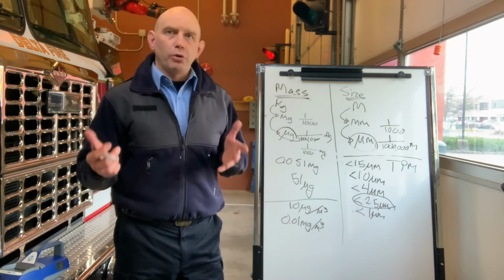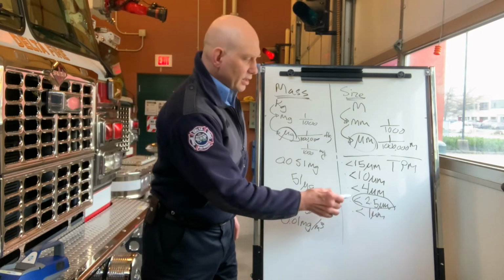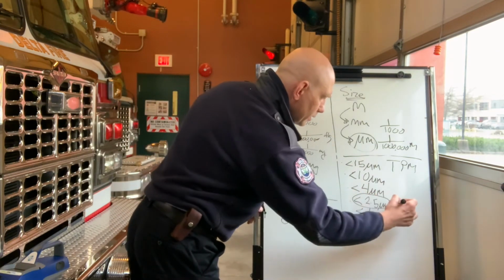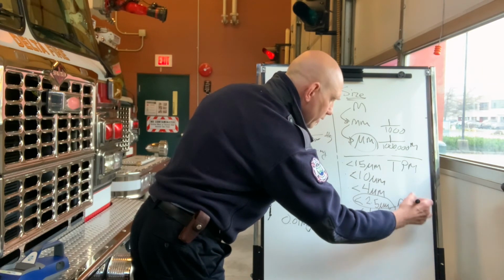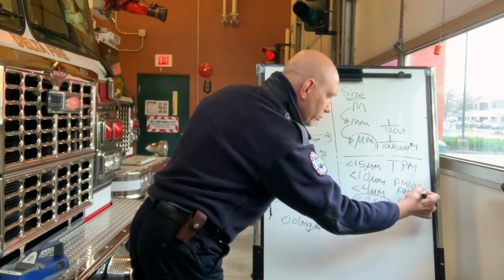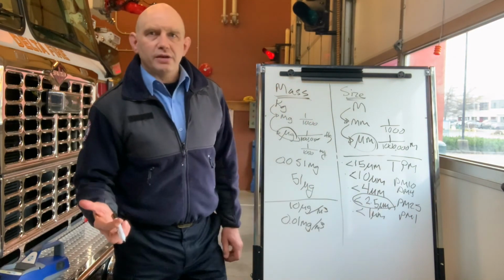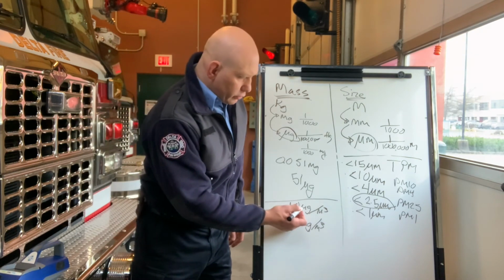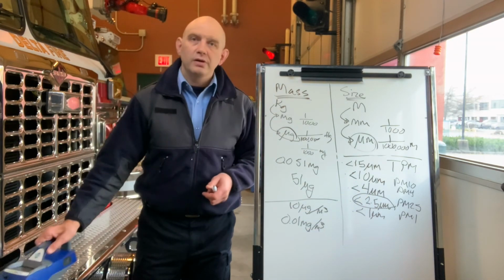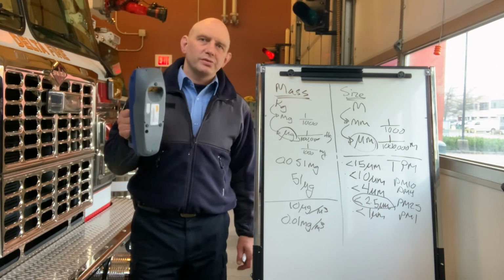So you might get a report saying the air quality is really bad. We've got 100 micrograms per meter cubed at less than 2.5 microns. And so you'll see this sometimes written as a PM 2.5. This would be a PM 10. This is a PM 4 or respirable. This is a PM 1. So now you understand when somebody says, we've got this many micrograms per meter cubed at PM 2.5. Now that you understand that stuff, you can use the quick reference guide and the manual to figure out how to use this machine. Now you'll understand what those numbers that you're getting actually mean.